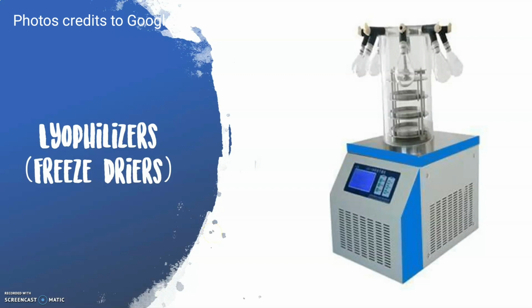And now, let us move on with lyophilizers. This is a lyophilizer, also known as a freeze dryer. These lyophilizers are usually used in research methods involving drying.